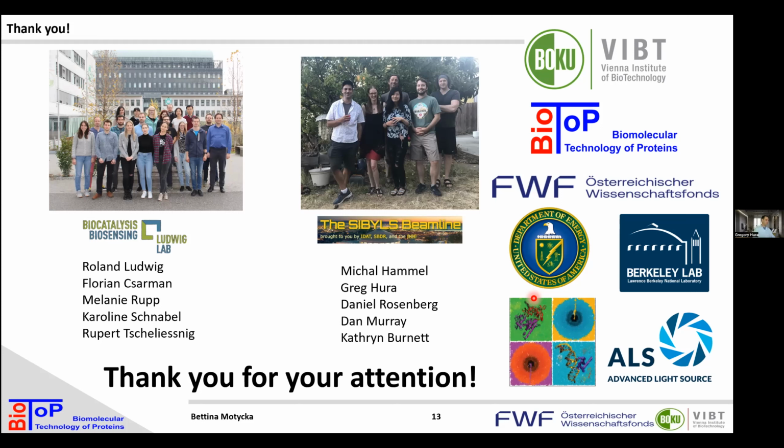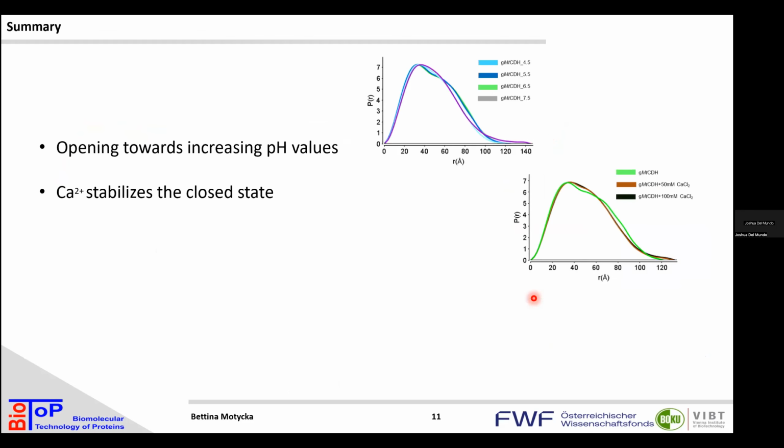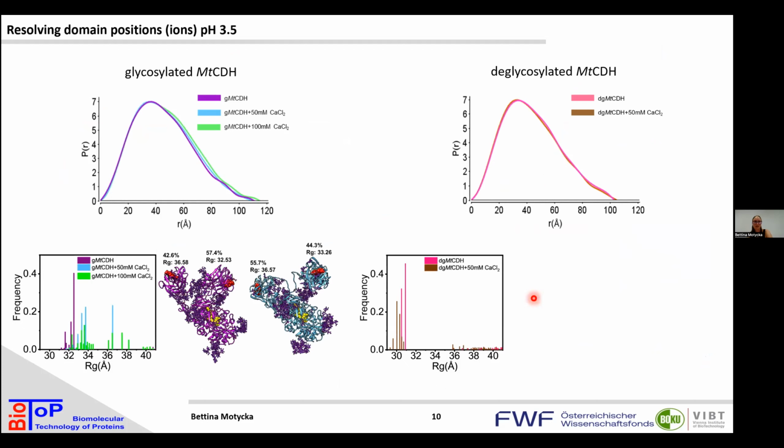Josh had a question. Yeah, just those models you had, when you had the cytochrome domain in different positions and different percentages. So is the model the average of those two with those percentages? Yeah, actually, for example here, out of this modeling approach you get the results, and these are the best fitting ones.